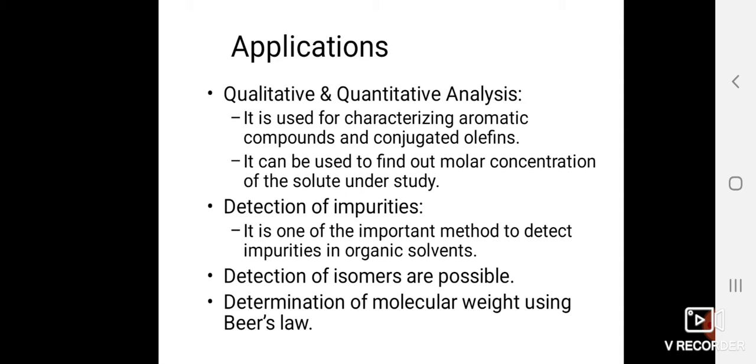Similarly, DNA or nucleic acids have 260 nanometers, and this kind of qualitative analysis is possible, like 340 for NADH. There are so many molecules having a particular range of absorption maxima.